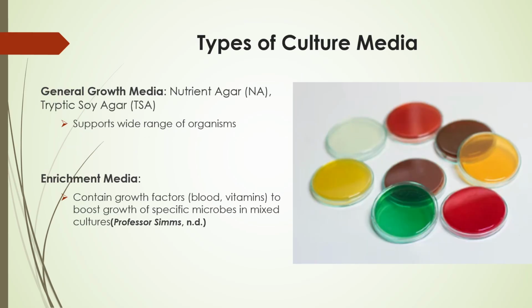Types of culture media. General growth media are nutrient agar and tryptic soy agar, which support a wide range of organisms. Enrichment media contain growth factors, such as blood and vitamins, to boost growth of specific microbes in mixed cultures.